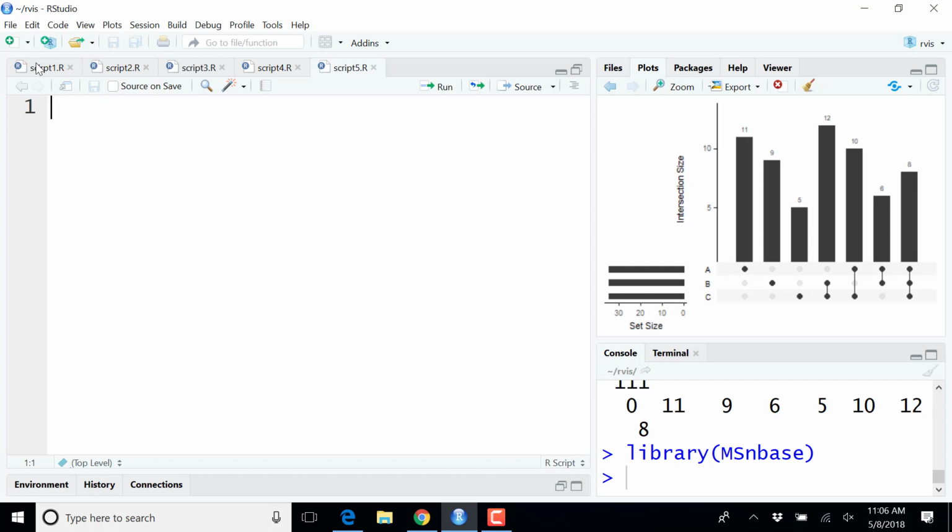It might matter if you want to have the lower order to the left, then you might want to switch 1, 3, 5, 2, 4, or depending on any other metadata, this will have an influence. But that's after your hierarchical clustering. And we'll see that this will have an effect when you produce heat maps, where you might want to have some constraints as long as your hierarchical cluster is correct. Otherwise, they're completely equivalent.